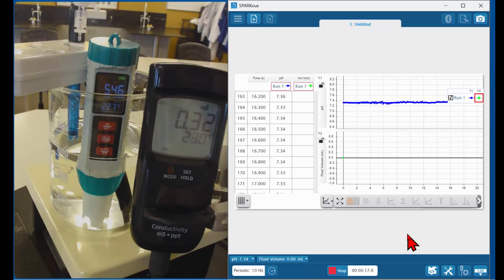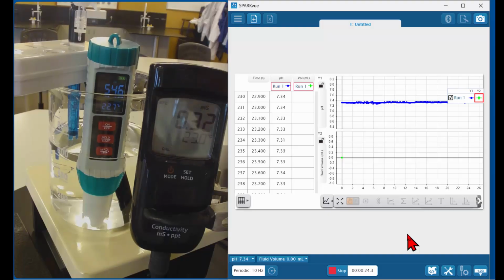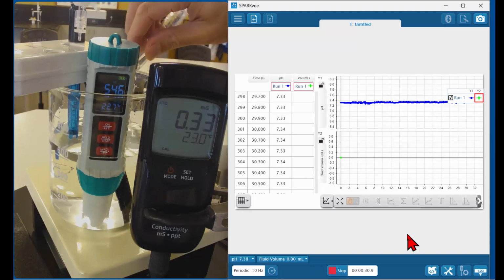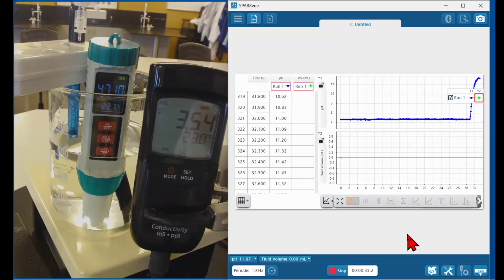And so I'm just putting 10 mils of base, sodium hydroxide, 1 molar, and then through the drop counter I'm going to put 1 molar HCl. And in order to cover all the probes, I've had to put about 400 mils, I think it is, or maybe half a litre in a 1 litre beaker. And there's a spinner down there.